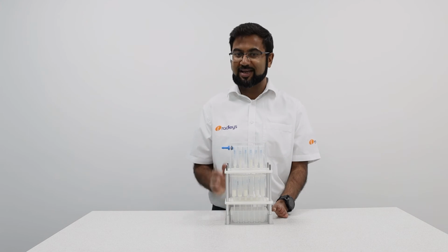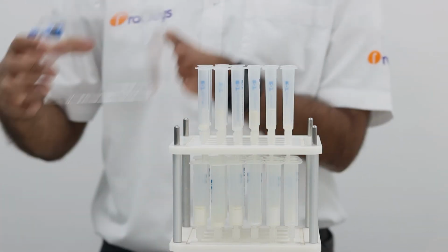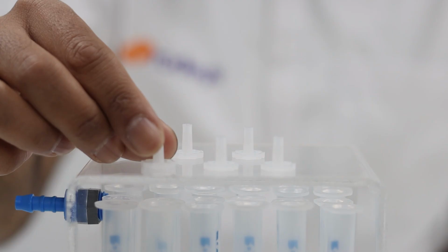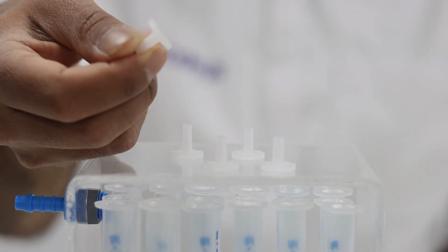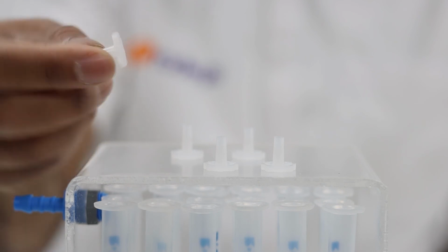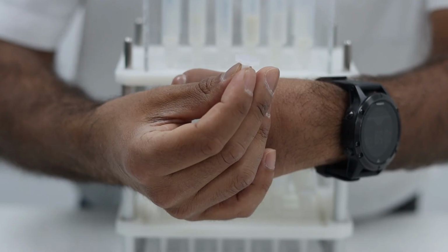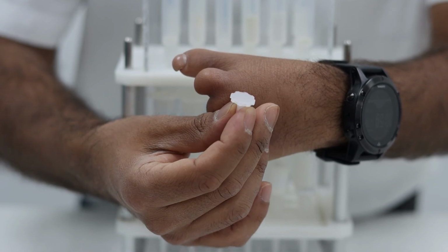We have an acrylic gas cover with an inlet that can be attached to a low pressure air or nitrogen supply. If the greenhouse workup station is being used with less than 24 columns on each plate, then you should blank off the unused positions with an empty column and an appropriate column cap.